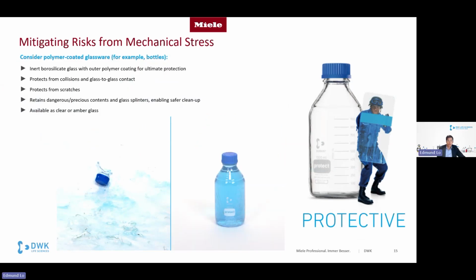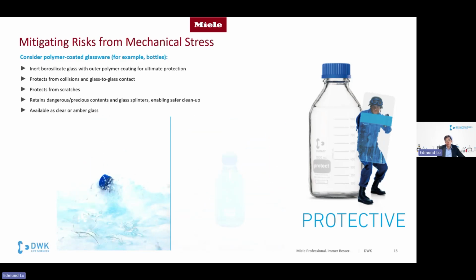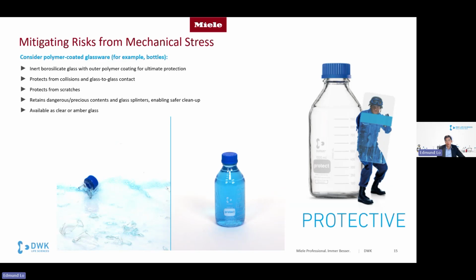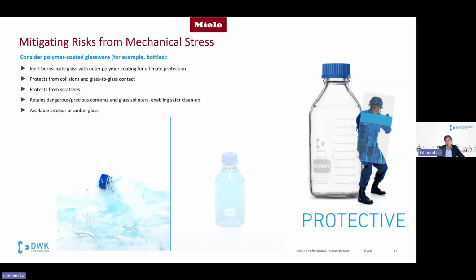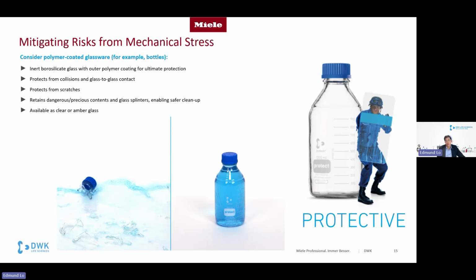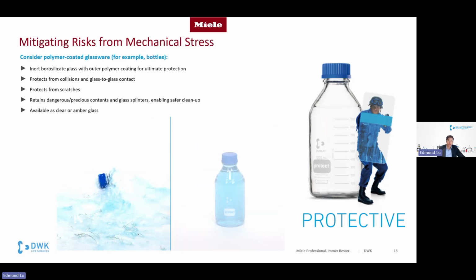We also recommend the use of polymer-coated glassware. They're worth considering for added safety. So the coating helps prevent scratches and glass-to-glass contact damages. And if the glassware is dropped, it holds the pieces together and gives you extra time to safely transfer the contents into a new container.